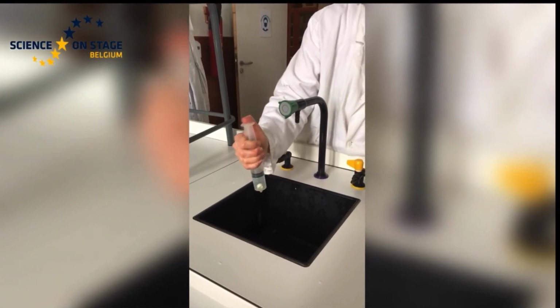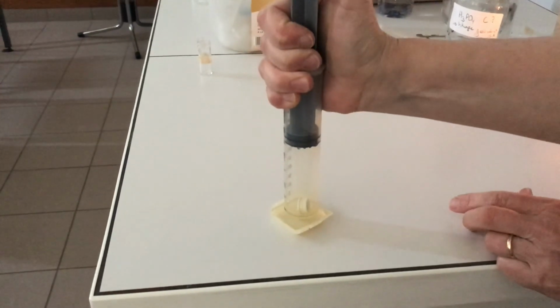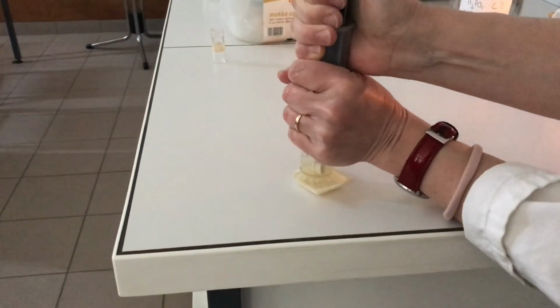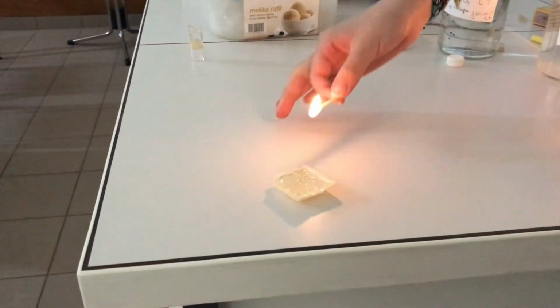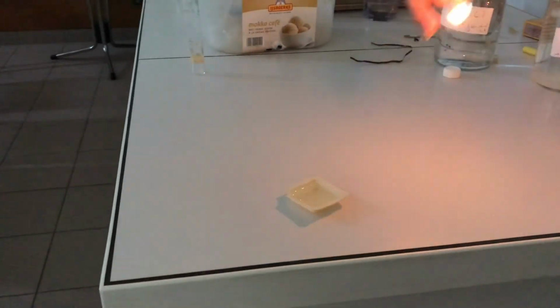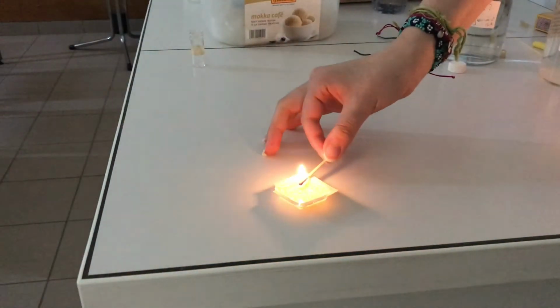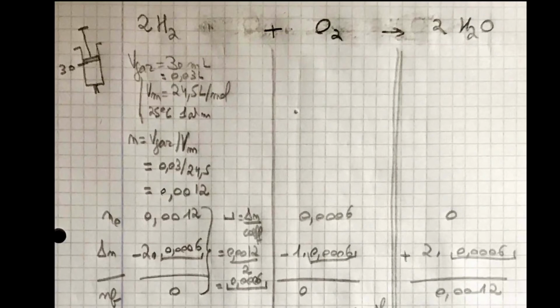And then with this oxygen you can make bubbles also in soapy water, and you will see that the flame of the match is revived, more brilliant. After looking for the properties of oxygen gas, we have to do the explosion. They like that. You look at the dihydrogen syringe.